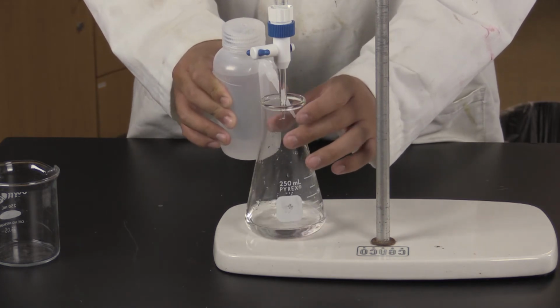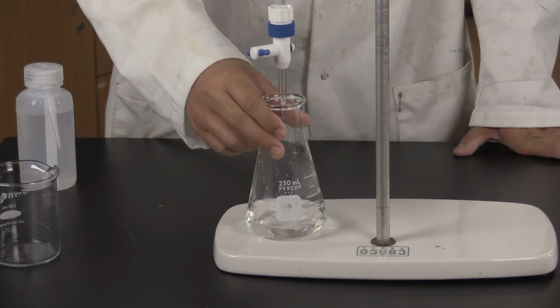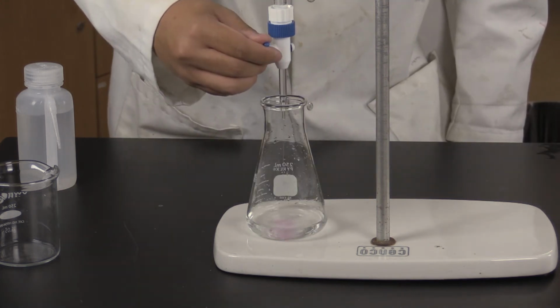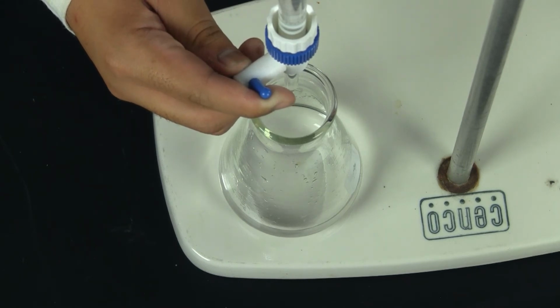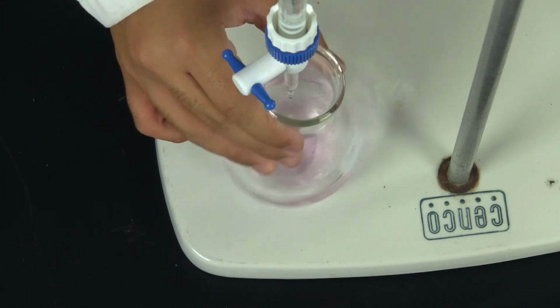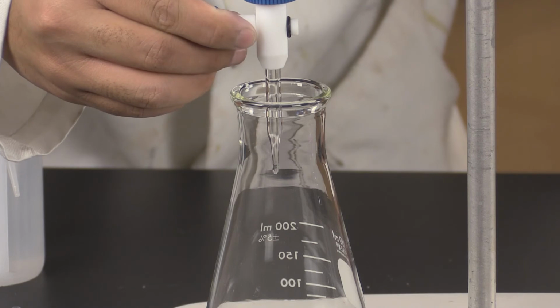Periodically rinse down the inside of the flask to make sure all of the titrant has made it into the analyte solution. Notice that the solution is temporarily turning pink. This is because of the phenolphthalein, and the closer you get to the endpoint, the more persistent that pink will be. The goal is to get to the faintest persistent pink with 1 drop or less of titrant.